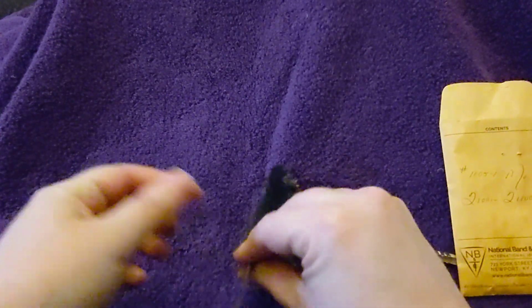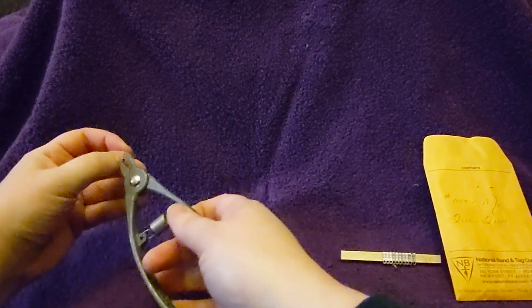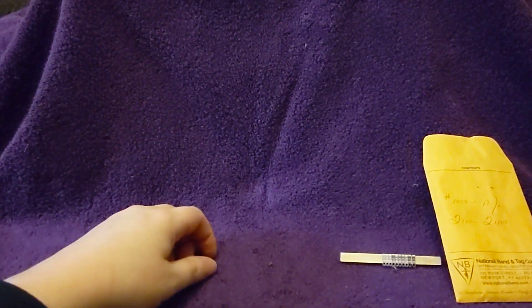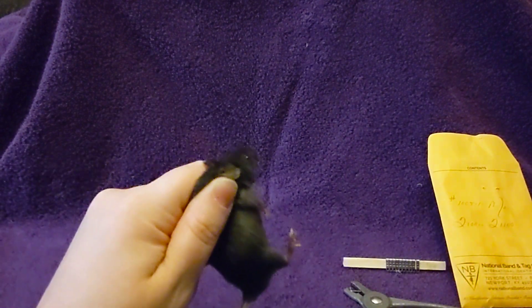I'll show you another one. We do have to be a little careful not to get bit — some mice more than others do not like being scruffed. Okay, I just applied another tag into the ear. The long part — the part with the hole — goes on the inside of the ear when you're tagging, but it will shift around so that it's on the outside of the ear when the mouse is wearing it.